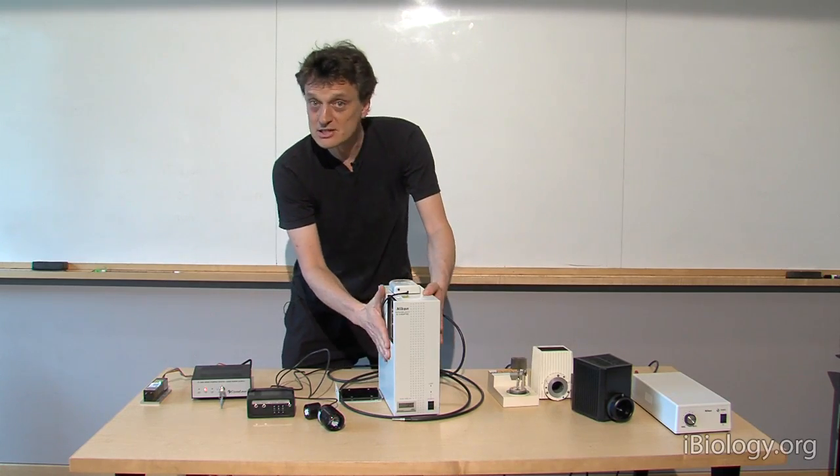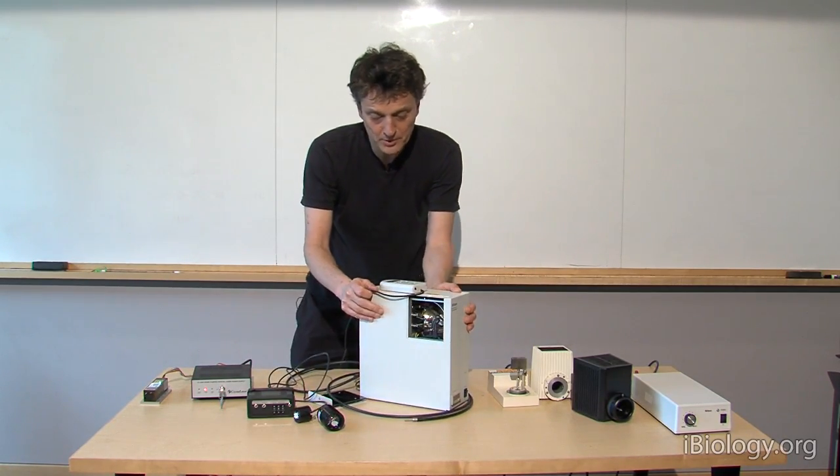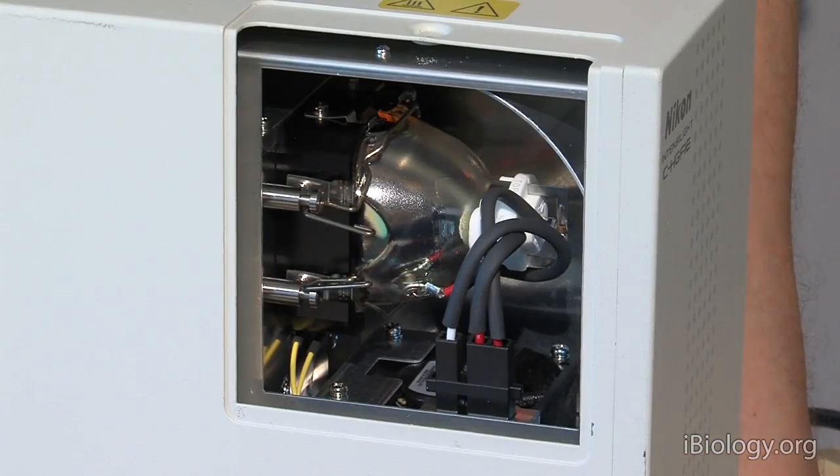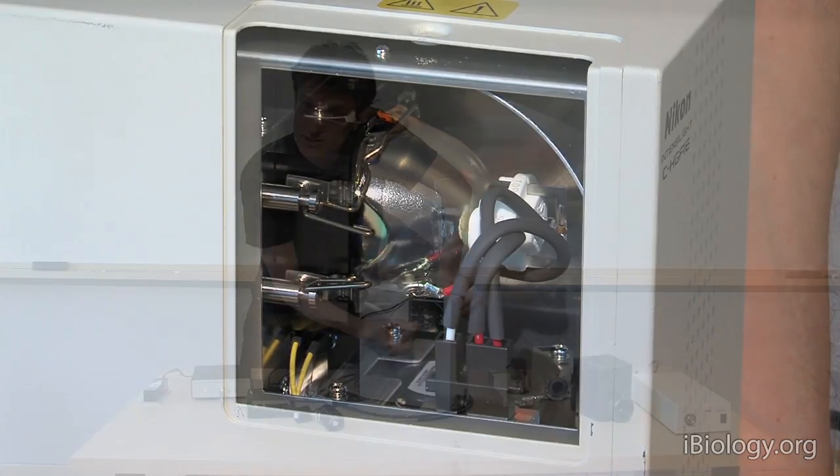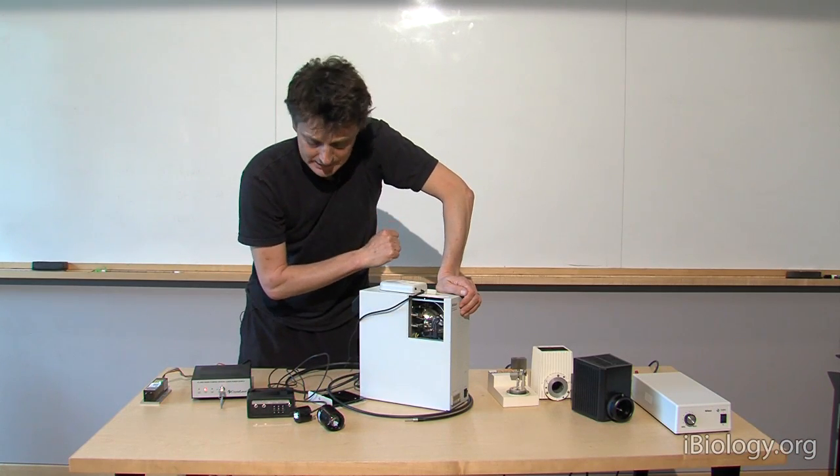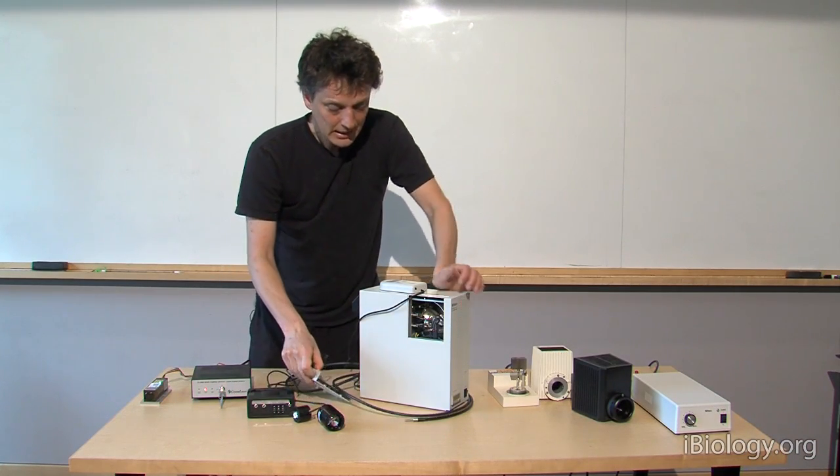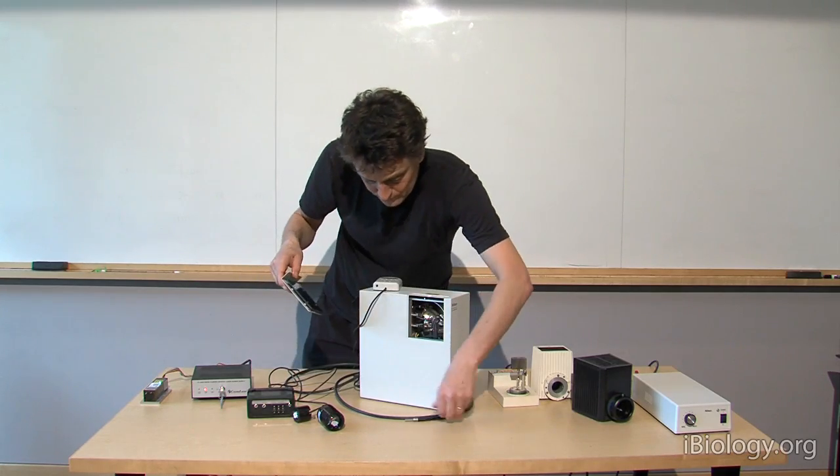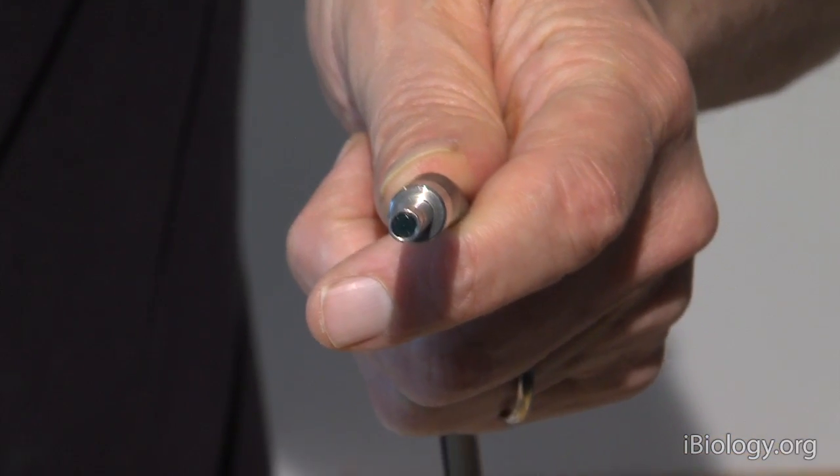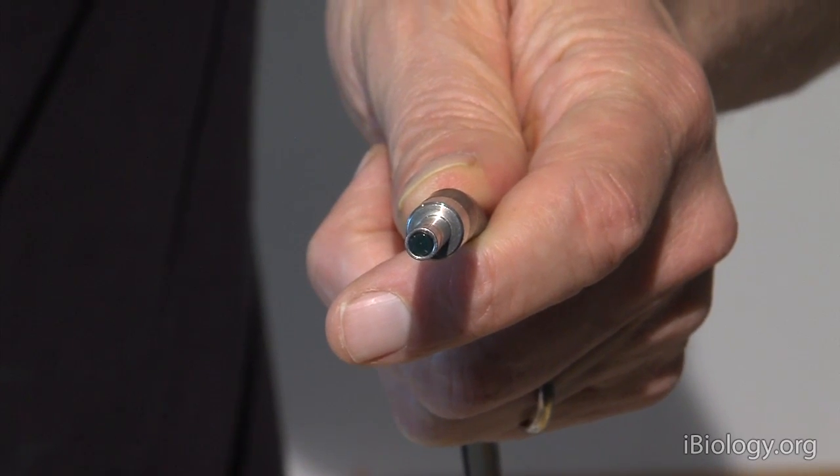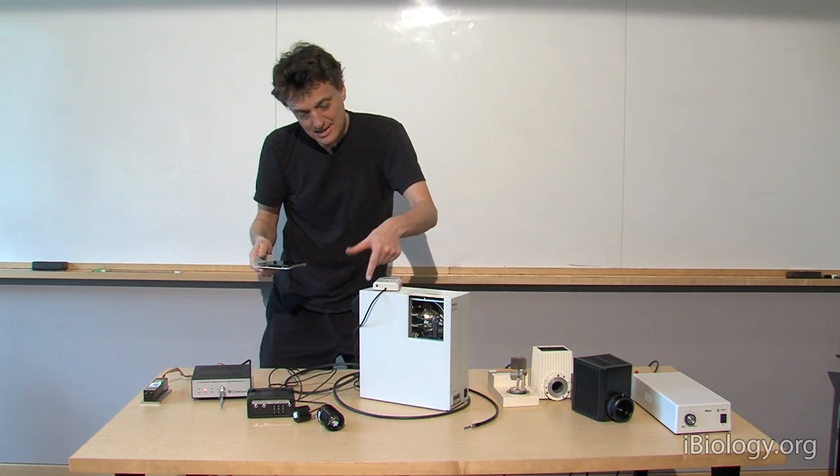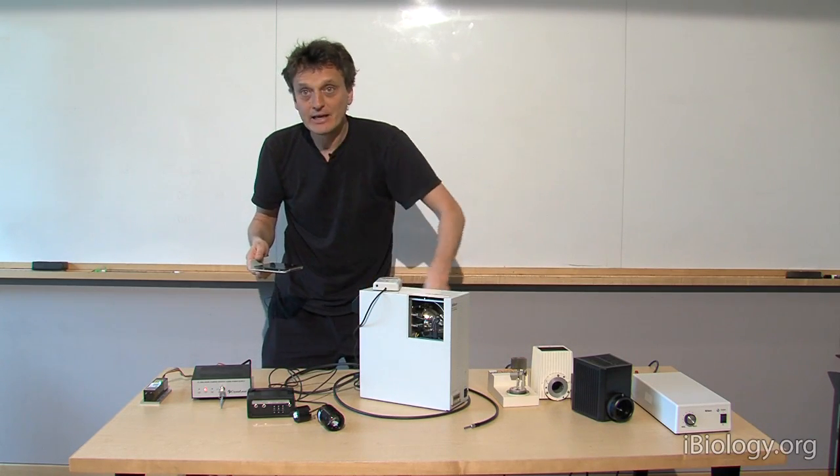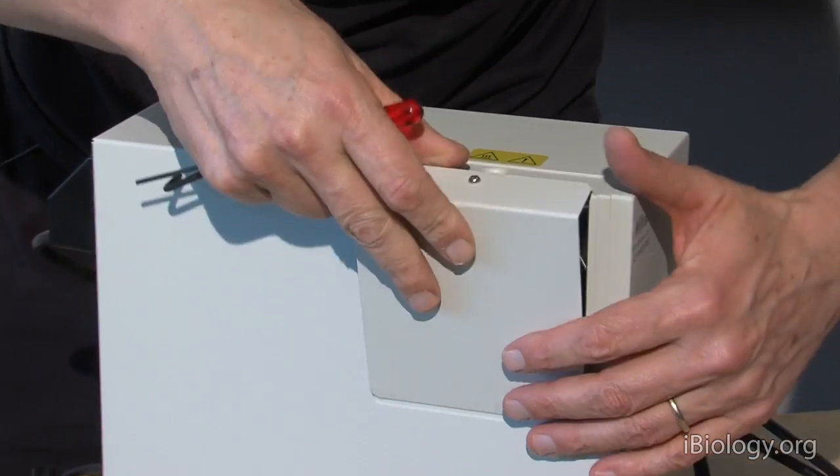Therefore little boxes like this one here have become more and more popular. Here we have a so-called metal halide illuminator. It's also a lamp and that thing just clicks in here. There's no alignment that needs to be done. The light is then delivered through this thing here which is a liquid light guide. It's a tube that is filled with a liquid, something like water.